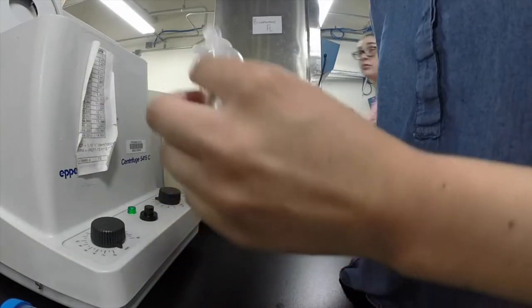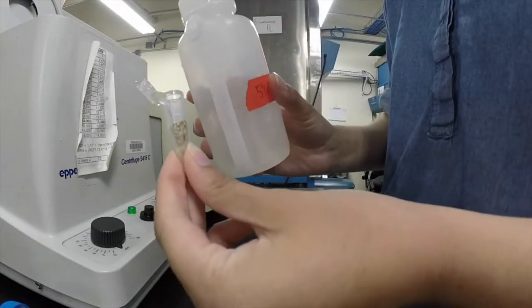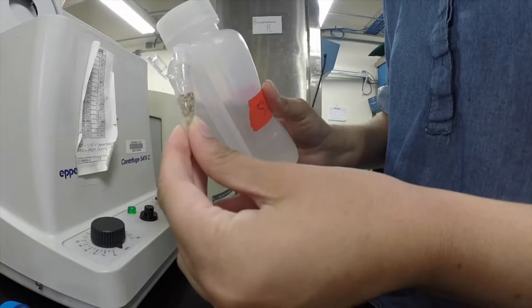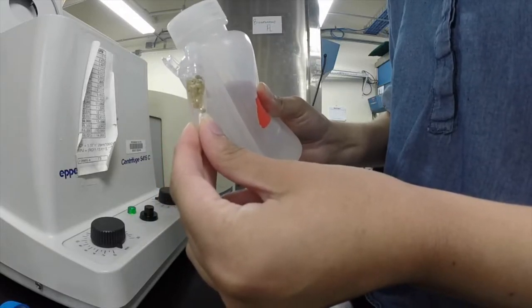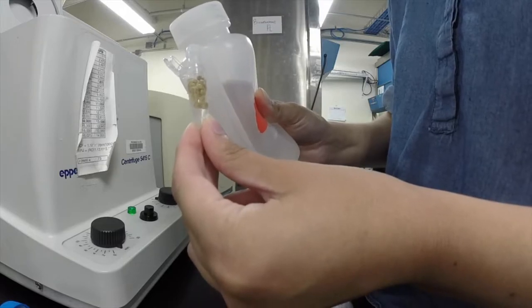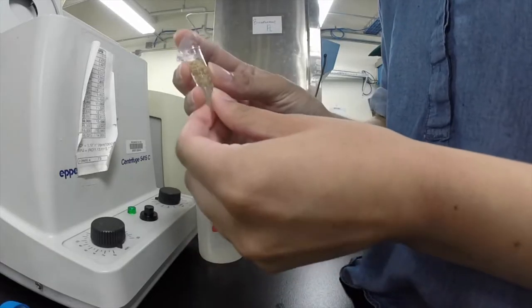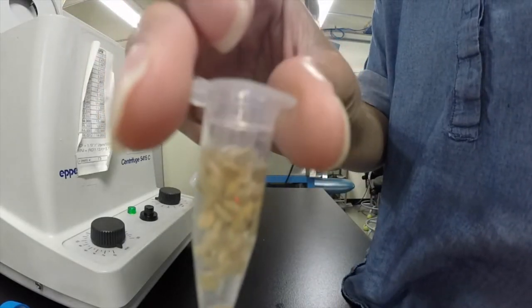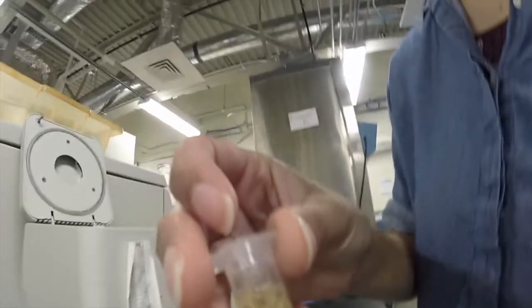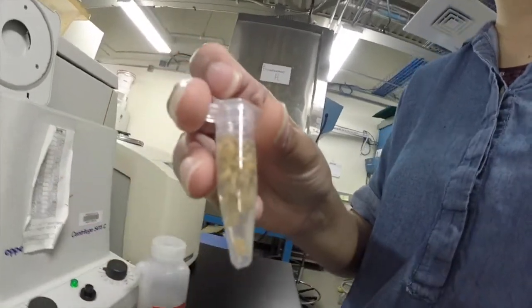And then now we're going to take our 5% bleach and just pour it until the epi tube is full and cap it. So now we have our tube containing our seeds and our bleach, and now we're going to let it sit and rotate for 20 minutes.